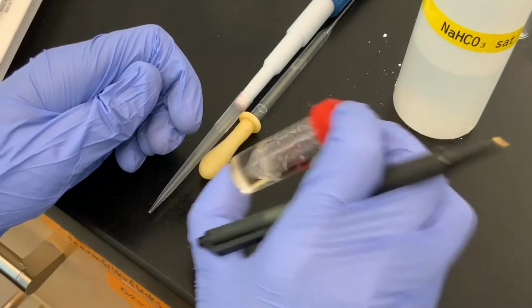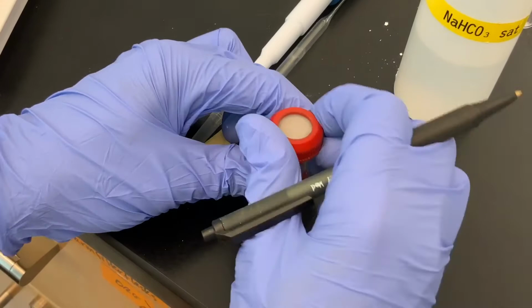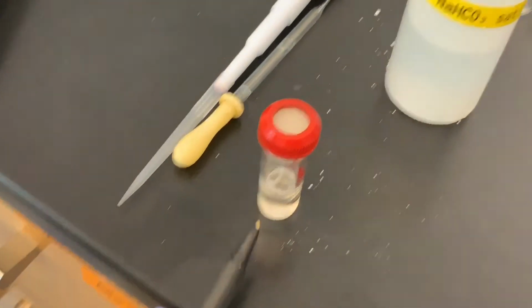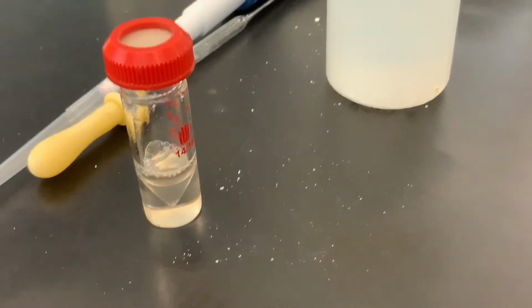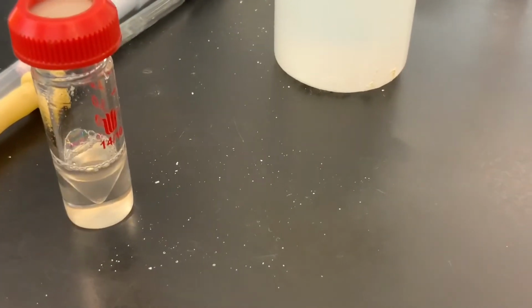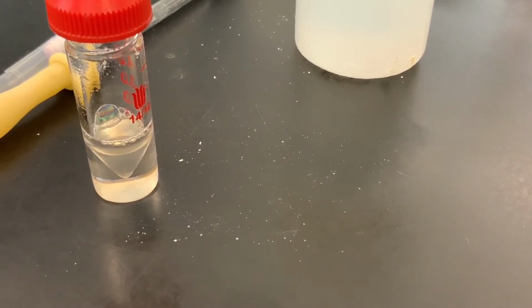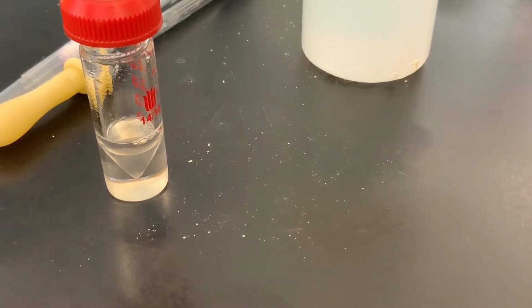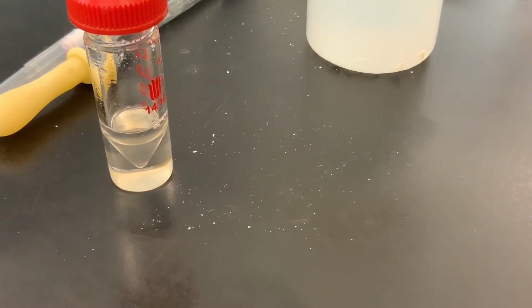The carbonic acid is decomposing into carbon dioxide gas and water, and so it's the same effect as shaking a bottle of soda, because soda water is carbon dioxide gas bubbled into it, and so you're forcing it to become a saturated solution of carbonic acid, essentially, and then you know that if you shake a bottle of soda, carbon dioxide leaves.